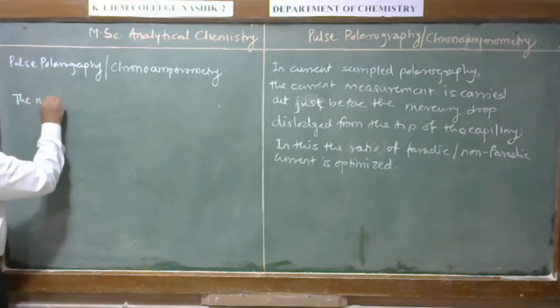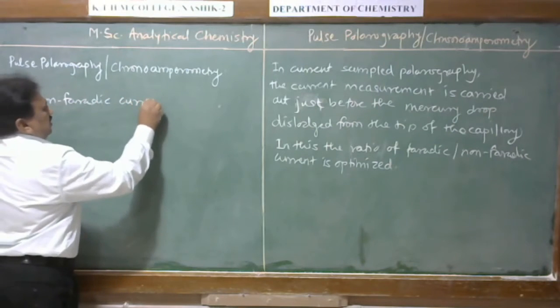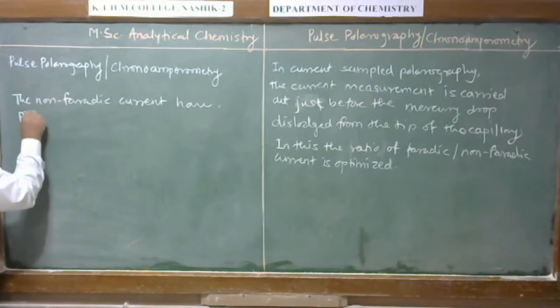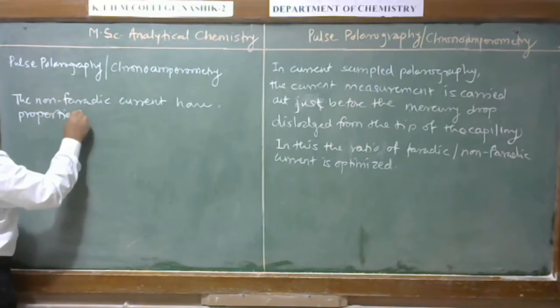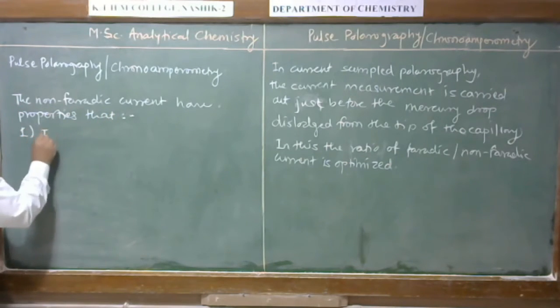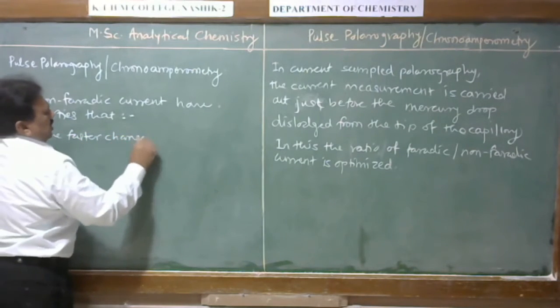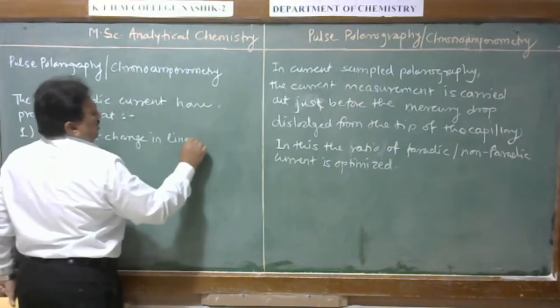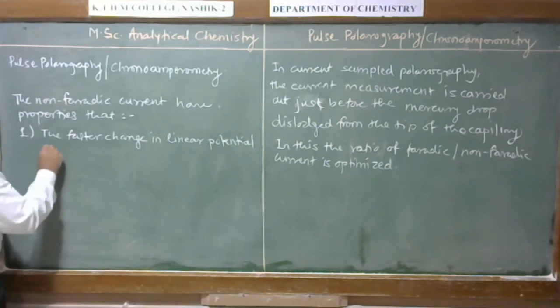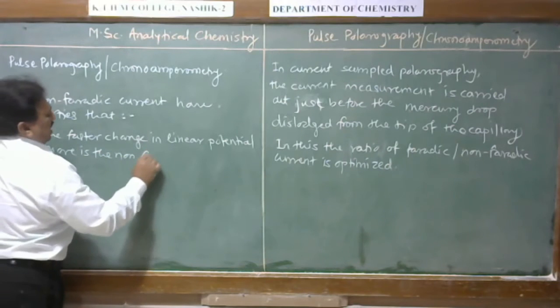The non-faradic current has properties. The faster the change in linear potential, the more is the non-faradic current.